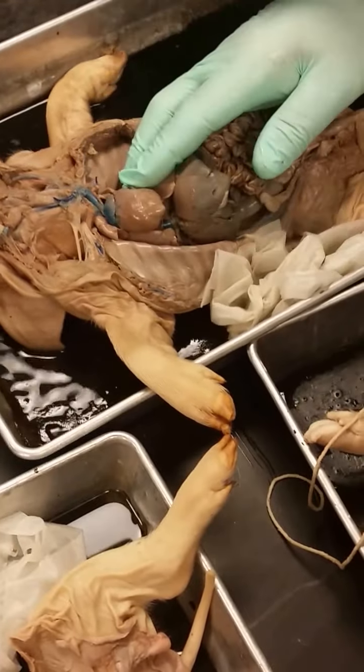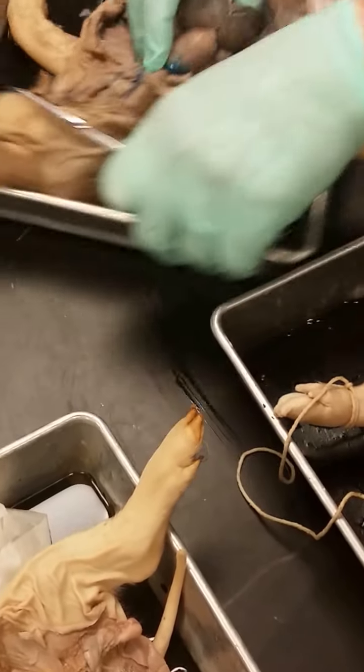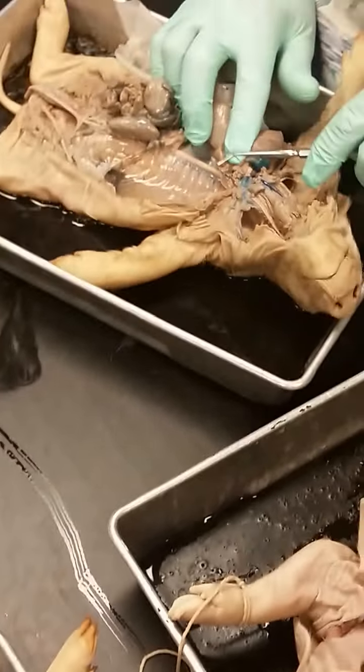Then, if I turn this at the side, this is the thoracic region, and here is the aorta coming down through the thorax. So this would be considered the thoracic aorta. The other thing you should be able to see, here it is, the esophagus. So there's the esophagus right there.